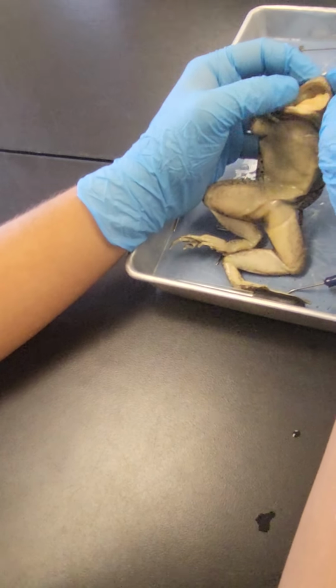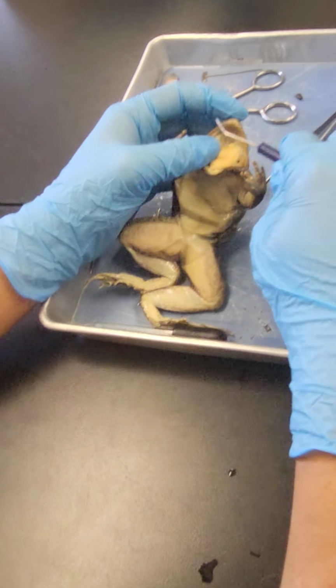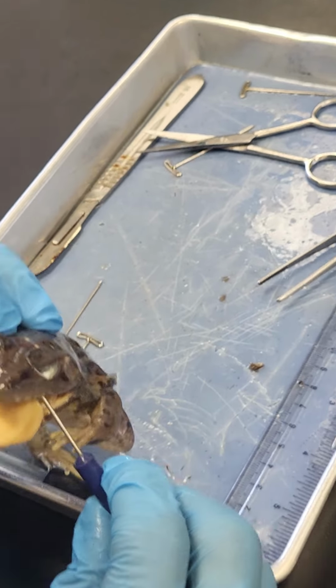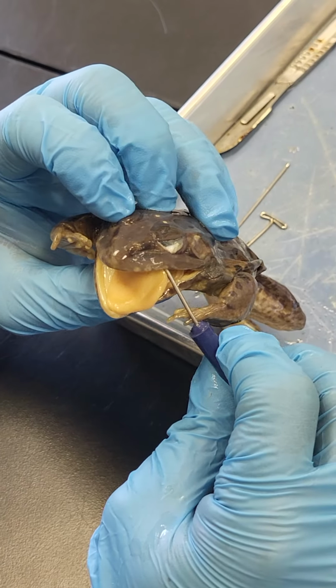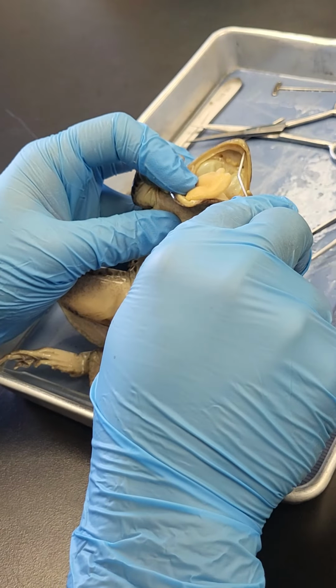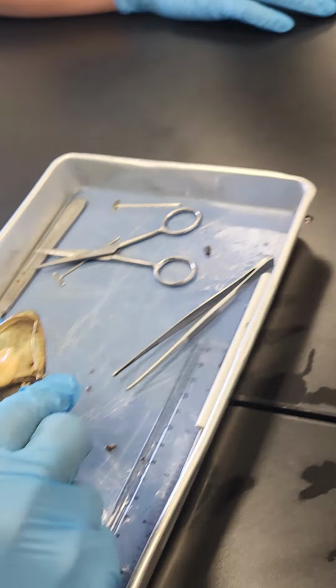Okay. On the roof of the mouth, you'll find two tiny openings of the nostrils. If you put the probe into those openings, they will exit on the outside of the frog. Wrong holes. They're at the very, very front, like right at the nose. Yes. On the holes. Right there, you see the little holes?